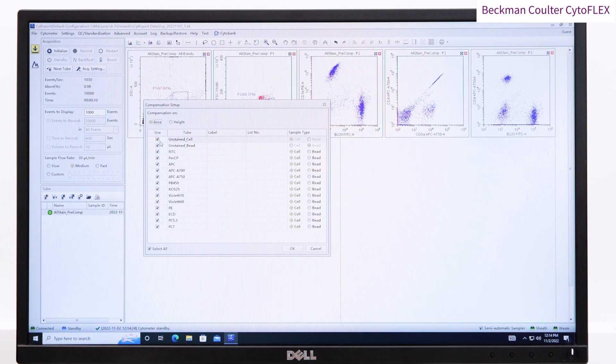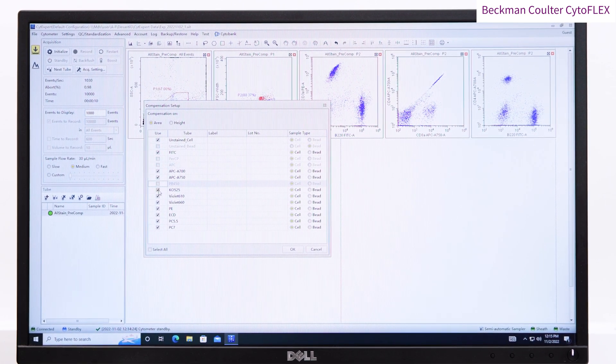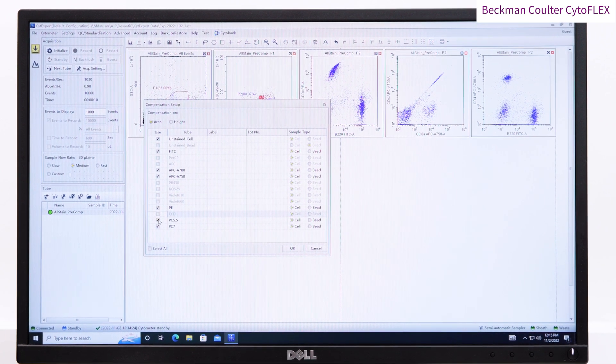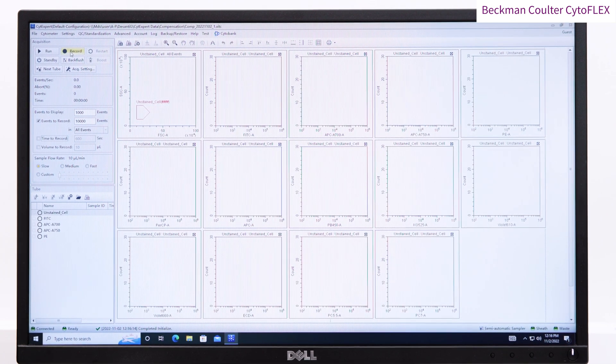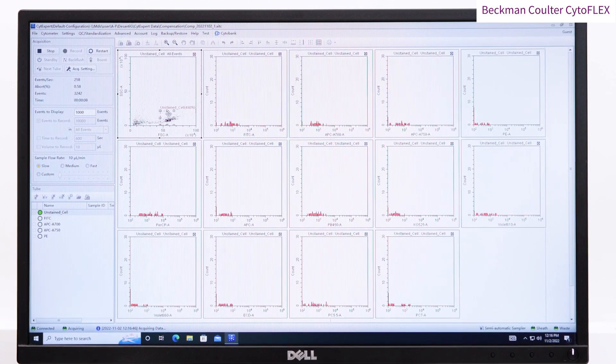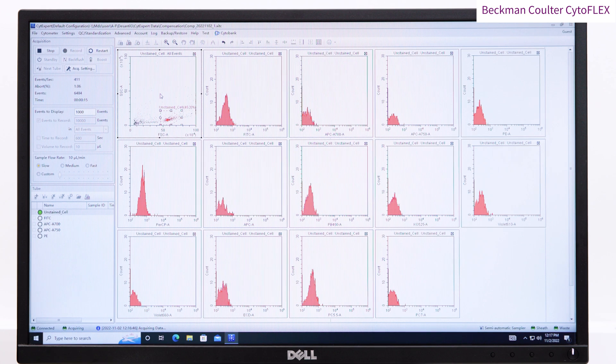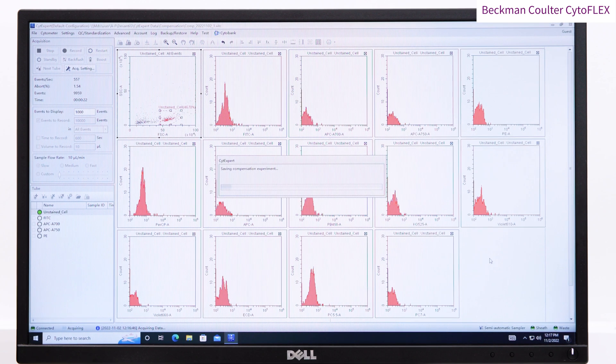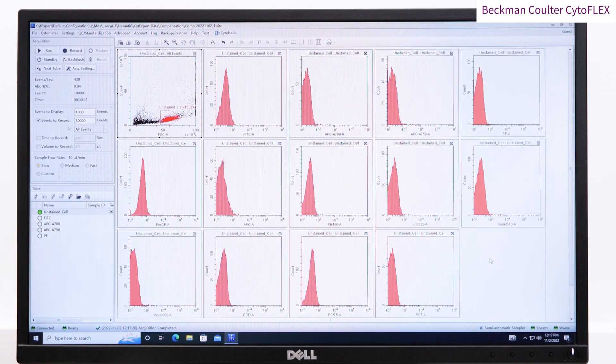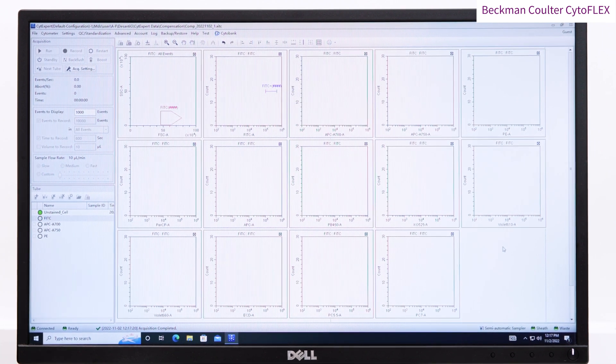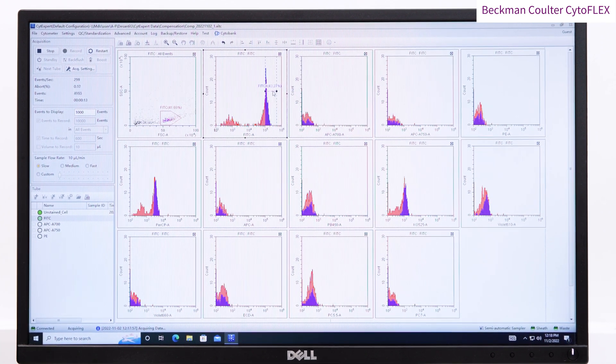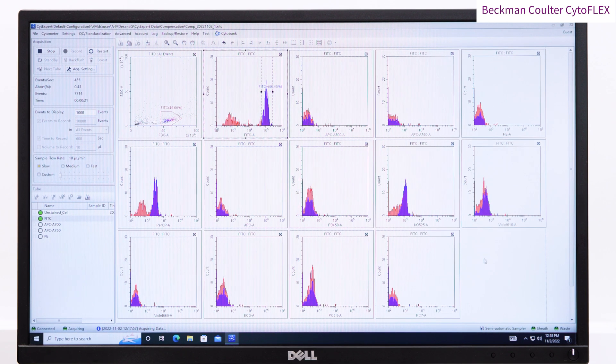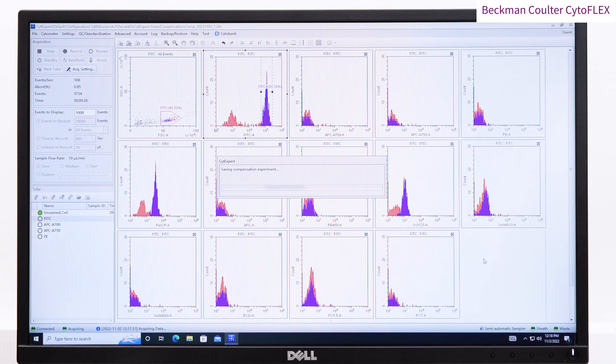Choose the correct channels and whether the single color controls are cells or compensation beads. In turn, click on each tube and record events from your unstained control and each of your single color controls, making sure the cells are gated in forward and side scatter and the positive fluorescent gate goes around the positively stained events.